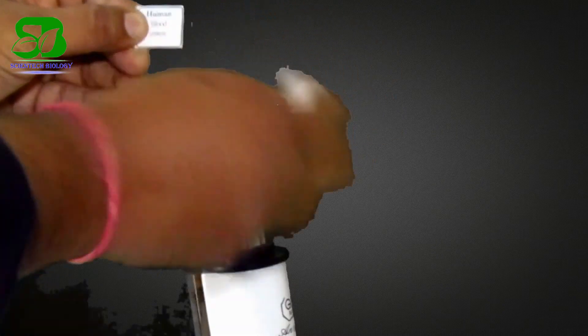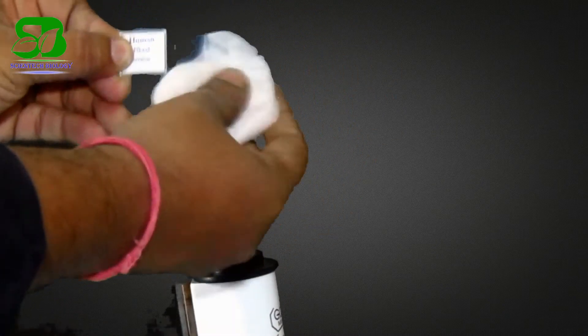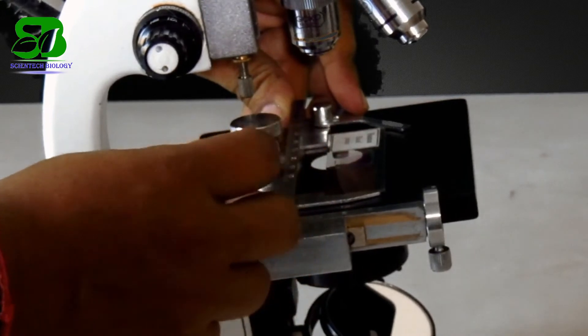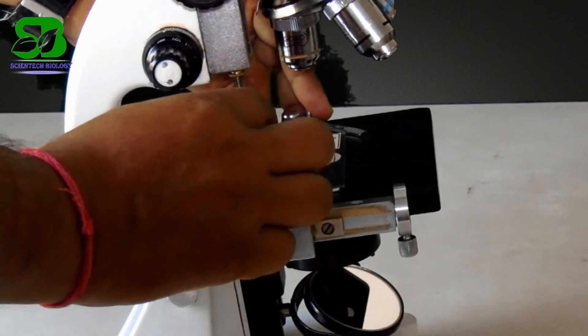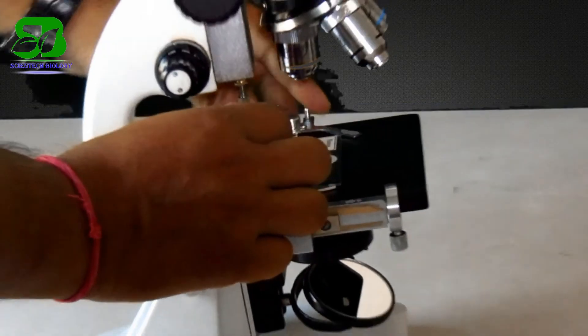Now clean the slide and place it on the stage. Look through the eyepiece and bring the object into the field of the microscope by rotating the mechanical clamp left and right and up and down.